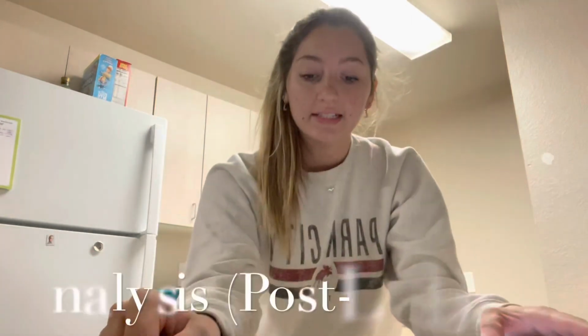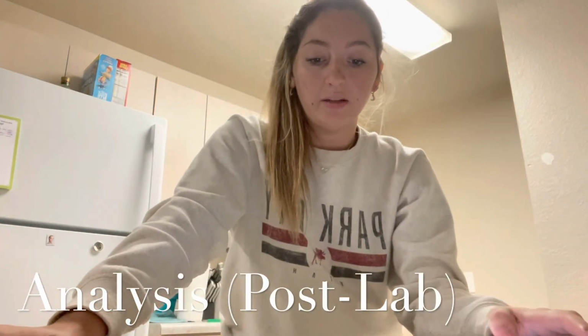Now for my analysis, I found the mass of the solvent was 6.50 grams. Mass of the solute was 1.51 grams. The original was to measure out 1.50, but I did have 0.01 grams extra, so I did put that into my calculations. My experimental freezing point of solvent is 48 degrees Celsius. My experimental freezing point of solution was 27 degrees Celsius. My freezing point depression was 21 degrees Celsius. So that was the difference between my solvent and solution freezing points.